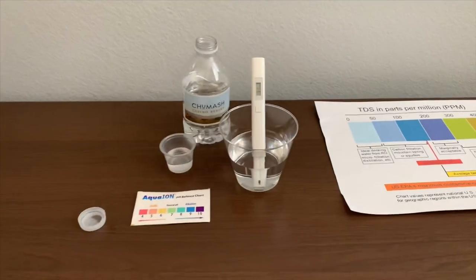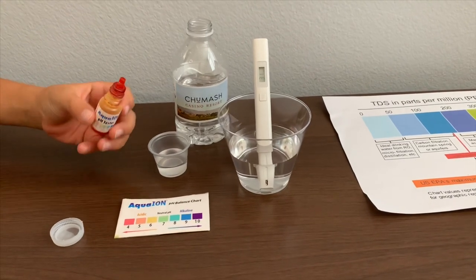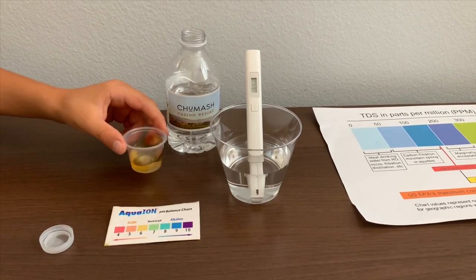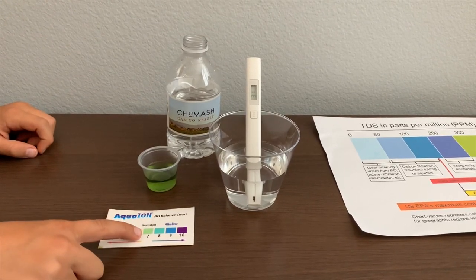Now let's test the pH level. If you want to buy this pH tester, check the link down below. Only do two drops. Let's stir it a little for a better result. I give this a 7.5 — this is a neutral pH.